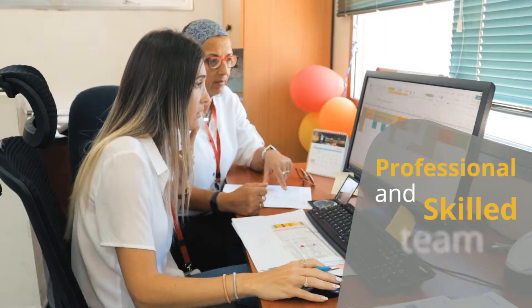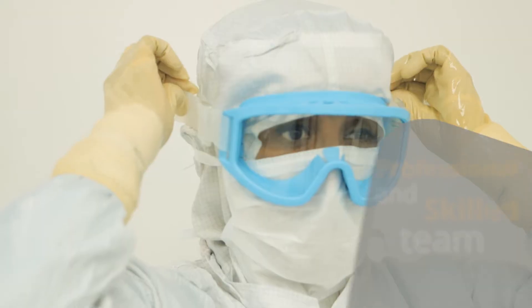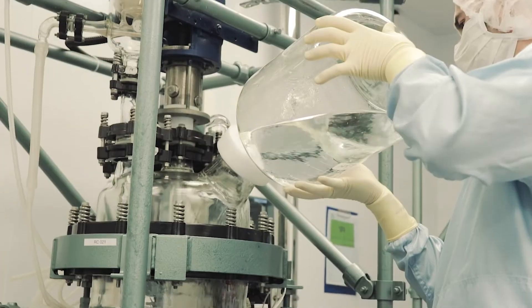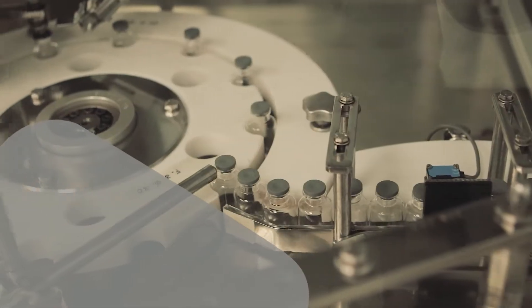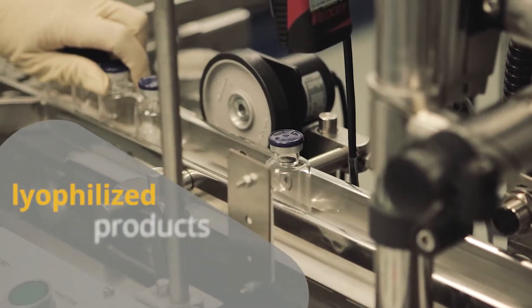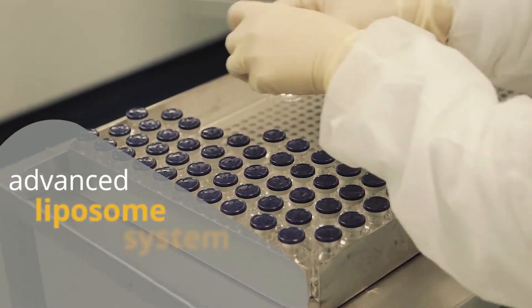Thanks to a professional and skilled team that does not miss a single detail. At Isotopia, we have the skills and tools to make any solution requested, including sterile solutions or lyophilized products and advanced liposome systems.